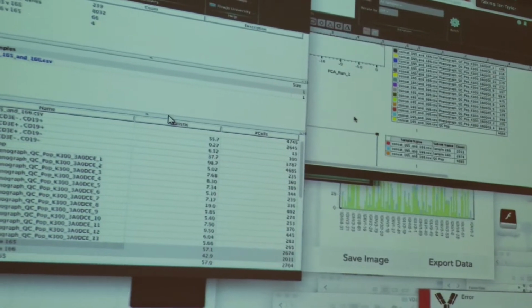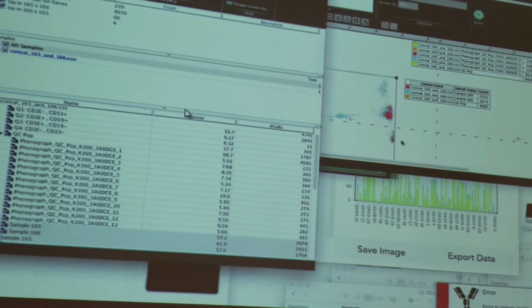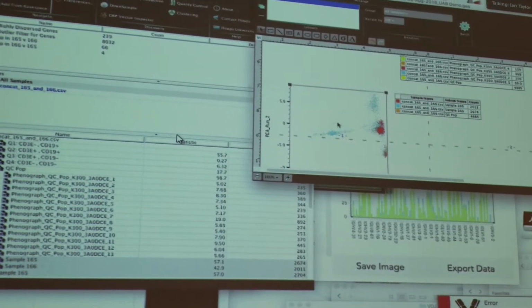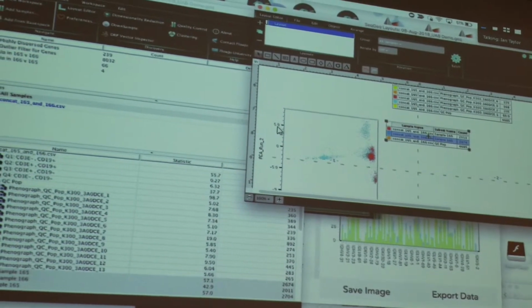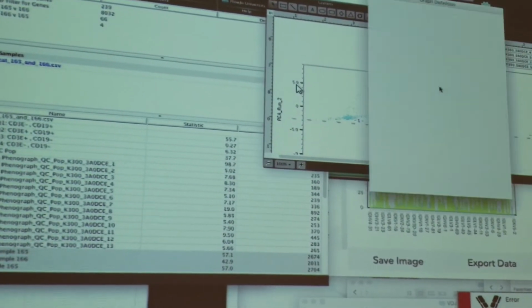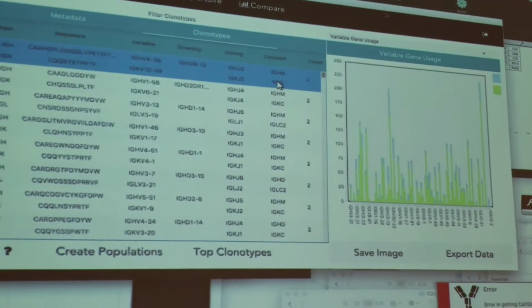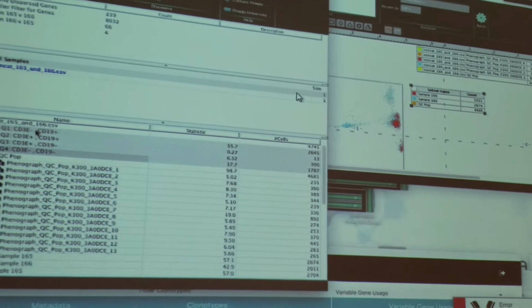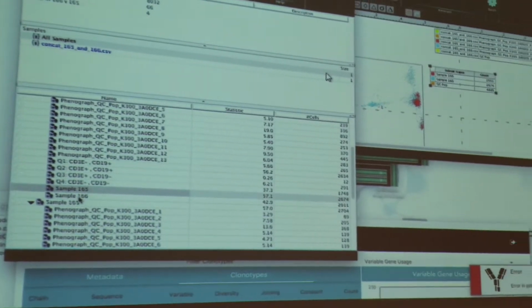And if they don't overlap, I would worry about batch effects. But remember we mentioned that the B cells seem to be absent for the most part from this cluster and this cluster? So it looks like maybe a lot more contamination in sample 165 relative to 166. That is true. We can deal with that. It'd be nice to eliminate those from the cluster, because we don't want that to influence it. We just want the B cells to influence. There'll be major dimensions if there's a different population.